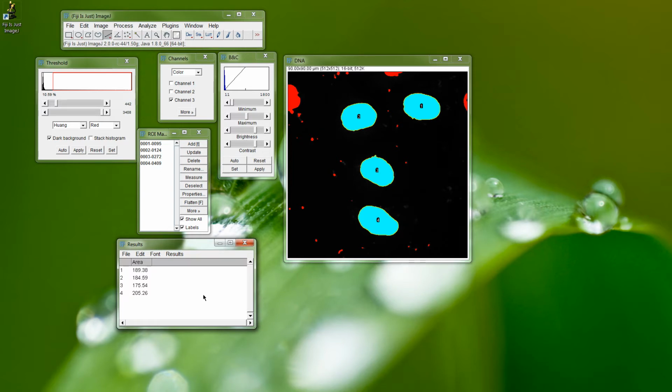And you can break it up into those steps, and you have to tweak it for your particular cell type, images, magnification, and things like that. But it's essentially the same thing. Let me know if you have any questions on how to set up and how to tweak it, and we'll go from there.